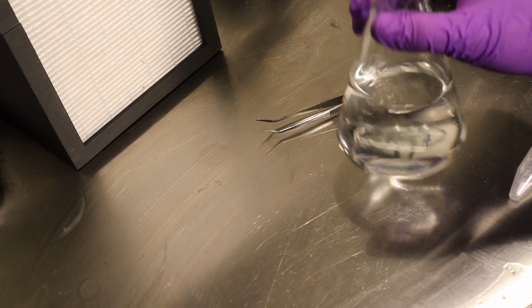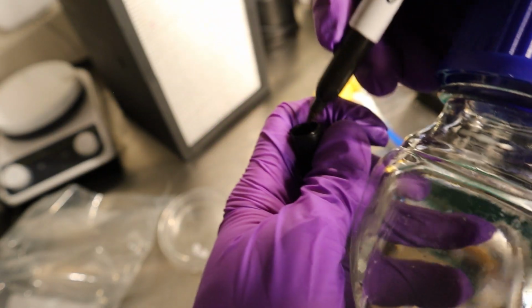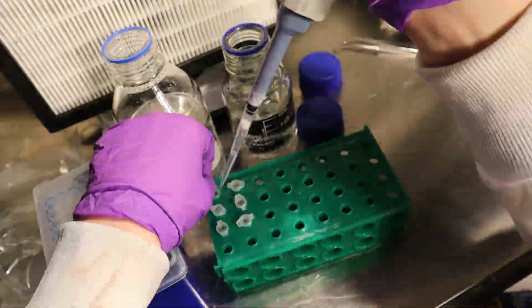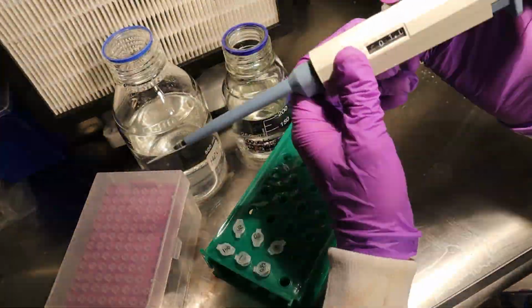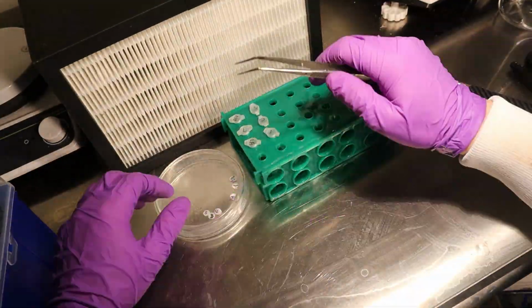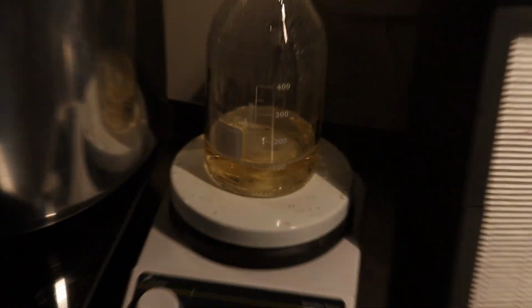Once dissolved, I vacuum filtrated it into a sterile bottle to filter out any microorganisms in the stock solution. I now needed to prepare the stock solution blanks for the discs. I decided upon doing 2 controls at 1 microgram a mil, 0.5 micrograms a mil, and then 10 micrograms a mil, 50 micrograms a mil, and 100 micrograms a mil. I then vortexed them and impregnated the now sterile discs with the corresponding blank.